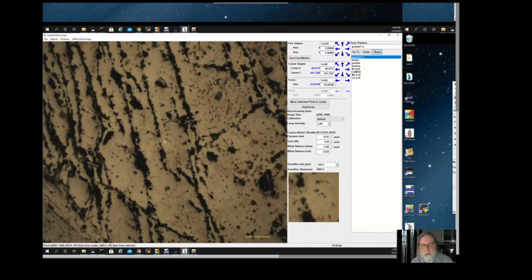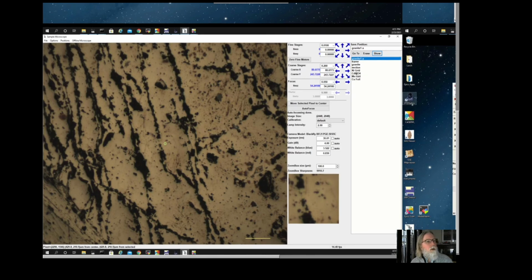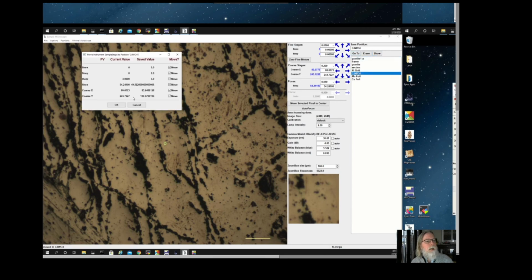If that's something you're interested in and you feel like you can send us samples ahead of time, let us know and we will be happy to work that out with you. Let me now go back to the phosphor and show you the beam on the phosphor, especially at 20 keV.